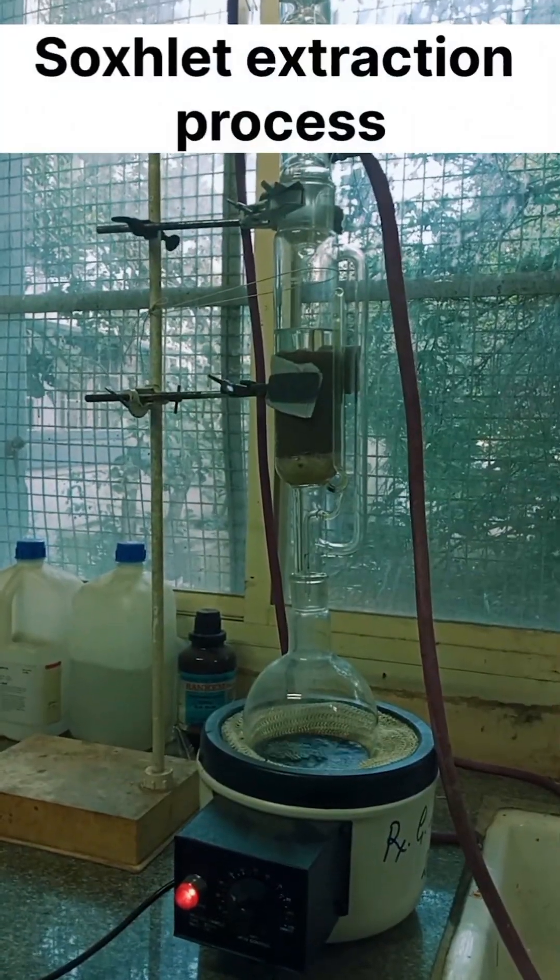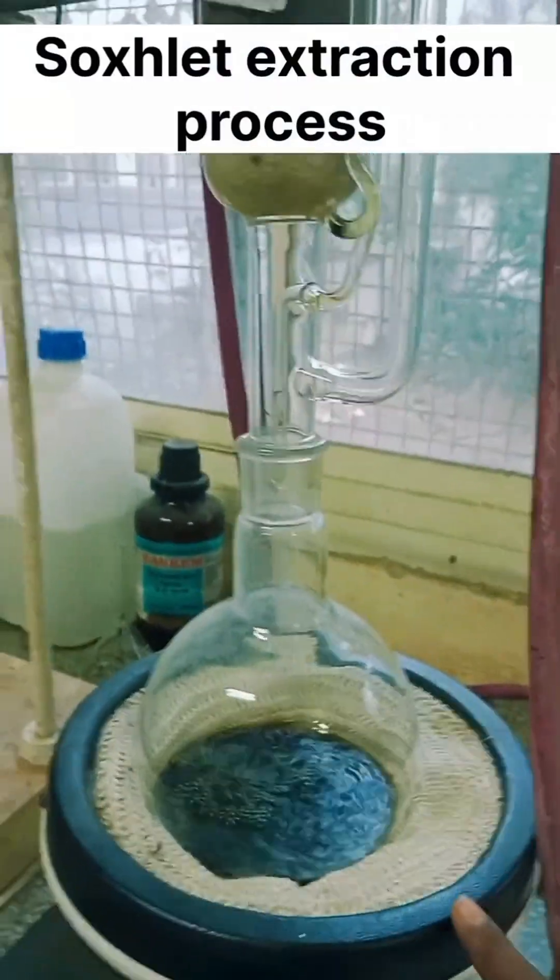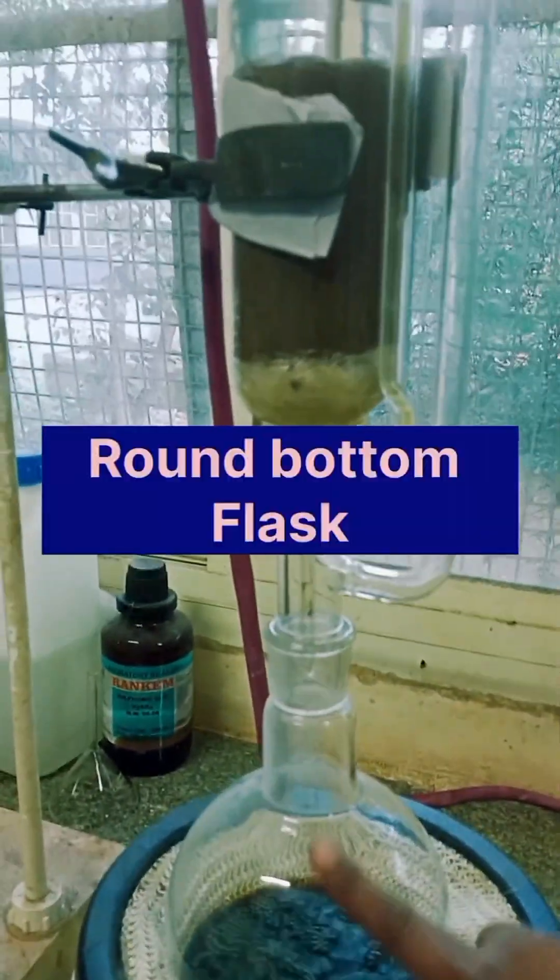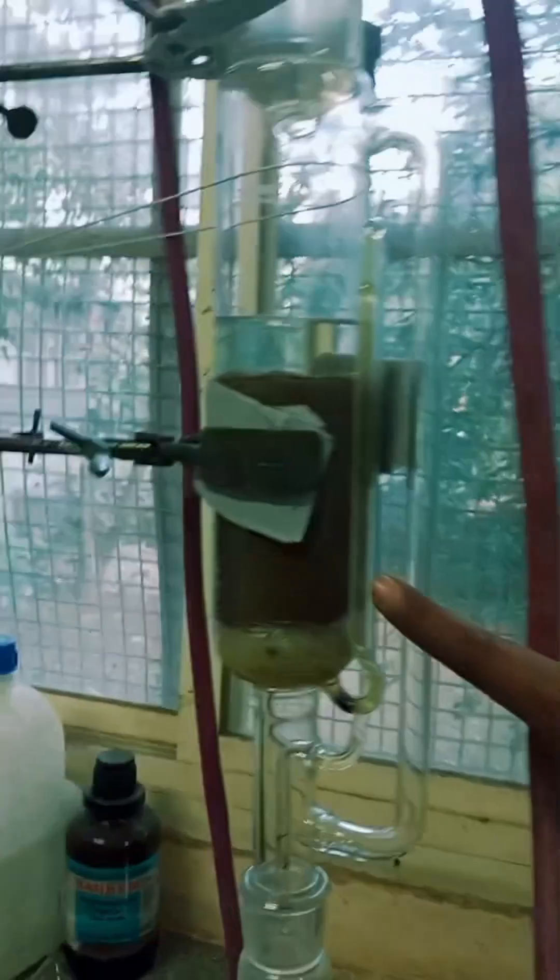Hello guys, let's understand the whole Soxhlet extraction process. This is the heating mantle which is used for heating of the solvent. This is the round bottom flask. The round bottom flask is connected with the Soxhlet extraction chamber.